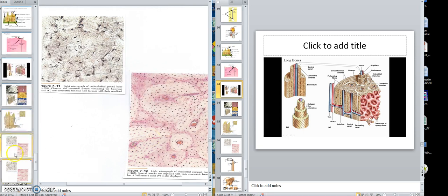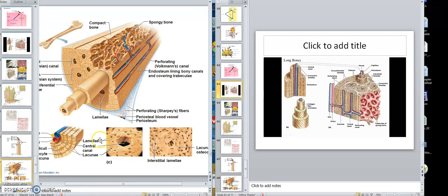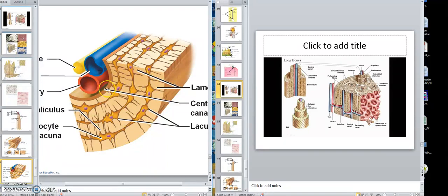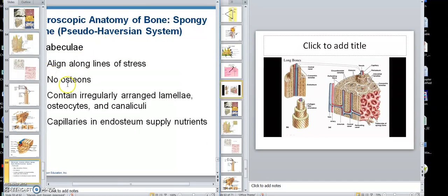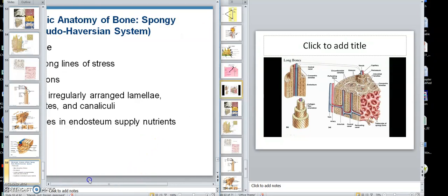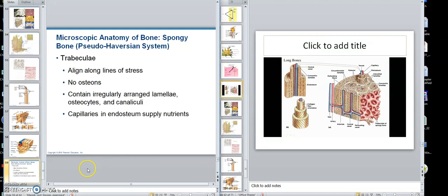So again, this here is what we have. This is to show you again that artery, the vein, the lamellae, and so forth. Here's spongy bone right there, but here's one of those osteons. Here's the artery and vein, and this is a good blowup of that particular aspect — the central canal and these holes here. Now we're going to close this one and then start on spongy bone on the very next one. So that's where we're going next — spongy bone. Thank you.